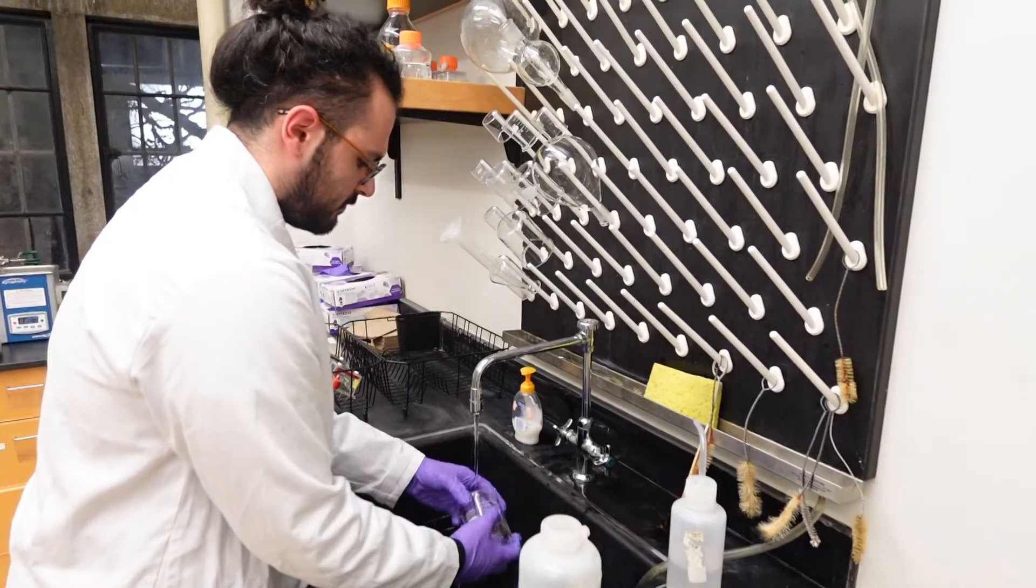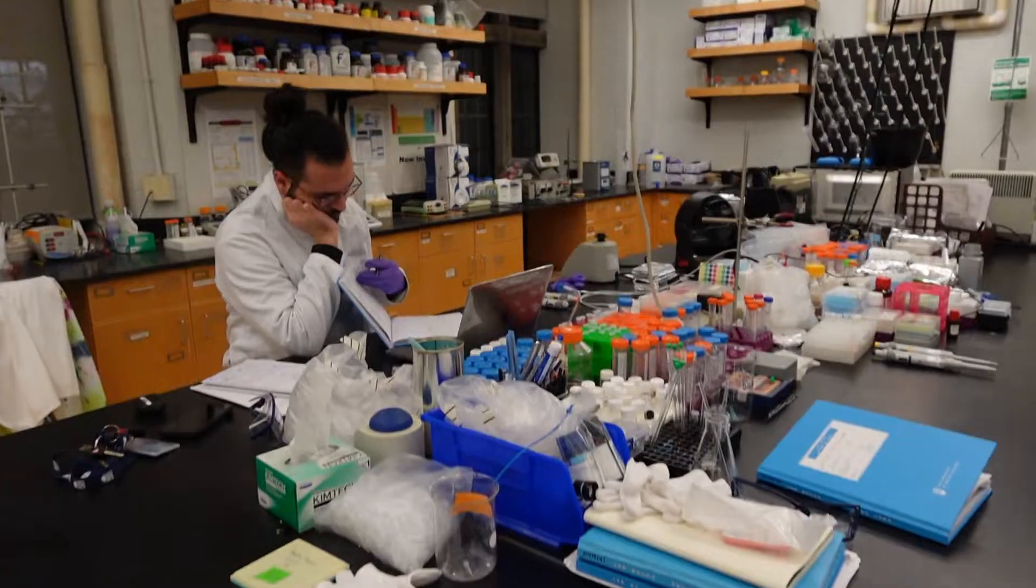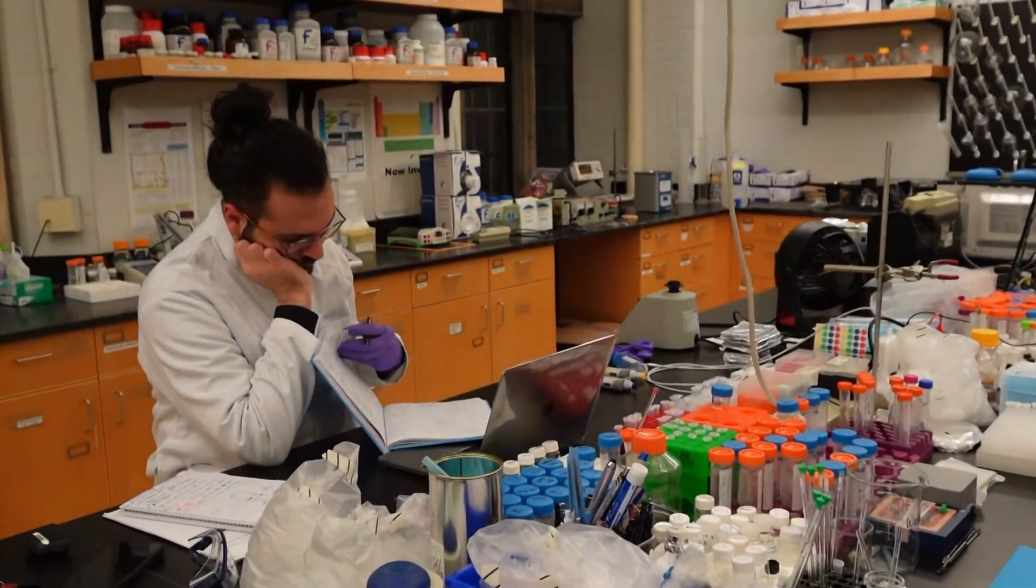On a typical day, I think it's not very glamorous, but there's a lot of cleaning and preparing work involved. And the actual experiment, the thing that is all hyped up in undergraduate labs doesn't really happen until you've planned for at least a day on what to do.